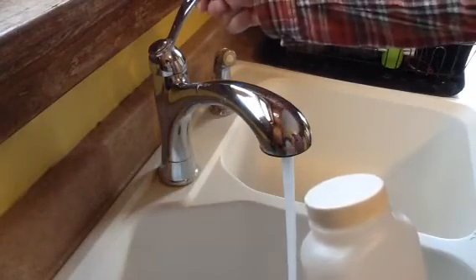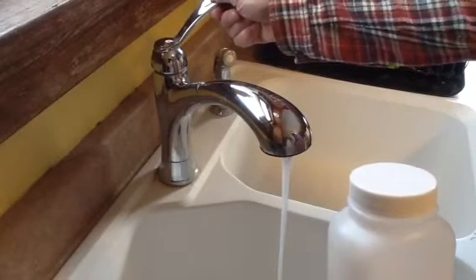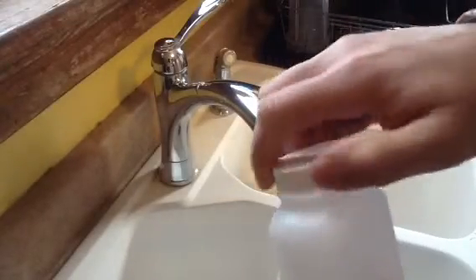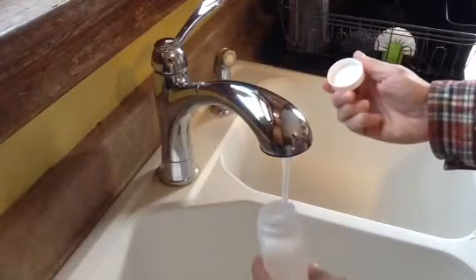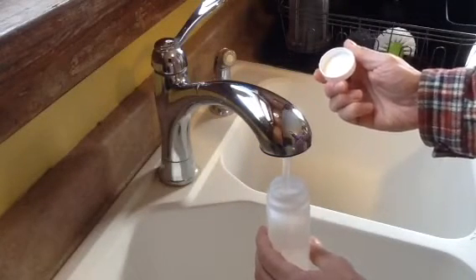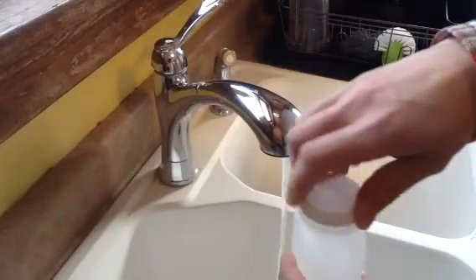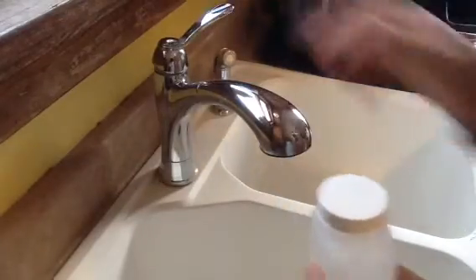Slow the water down till it's about a pencil width thick. Just a reminder, this is a sterile bottle, so avoid touching the inside at any time. Unscrew the cap, and without placing the cap down, move the bottle underneath the water, filling it to where the bottle narrows. After the bottle is filled, replace the cap and make sure the cap is on securely.